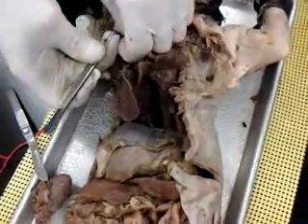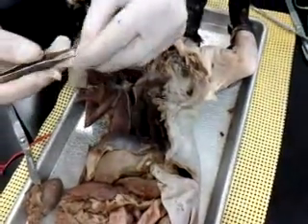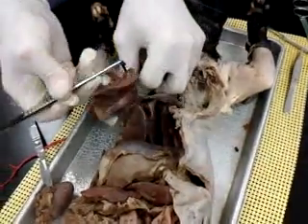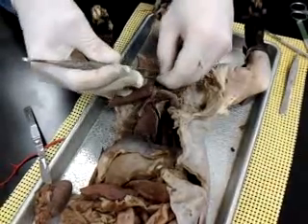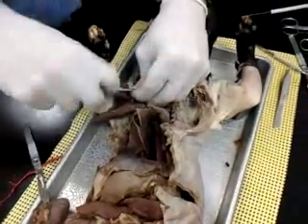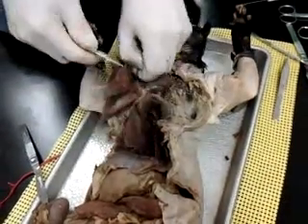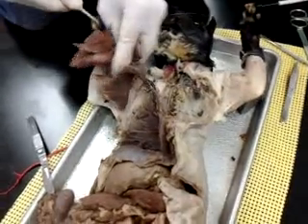Someone get me another pair of forceps maybe out of yours. You have a dissecting set there. These forceps aren't very good. Need someone, yeah. Trying to get this blue latex out of the way that was in the pulmonary system.